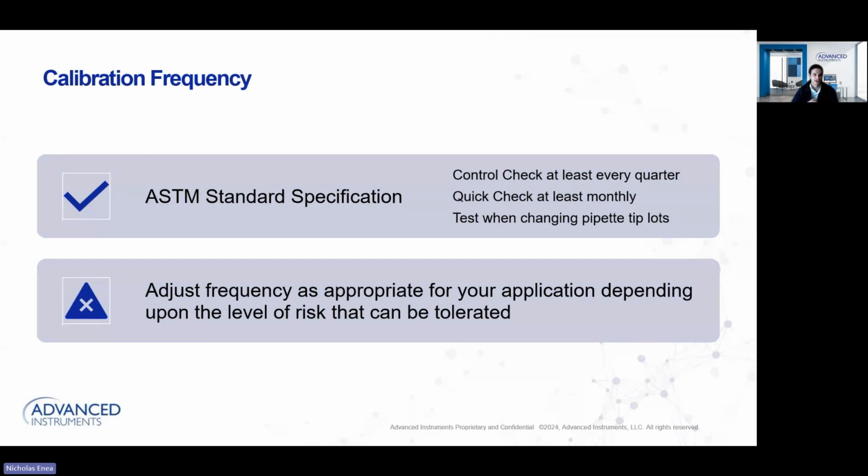For those of you that are working in highly regulated environments or things that involve patient samples, where you can't have rework, or if there is an error, it's a compounding error, then the frequency may be a lot more. Or if you're working in an R&D laboratory, which I like to call the Wild Wild West, where I came from, it's maybe not as often when it comes to some of your application and frequency verification and calibration checks as well. It's really up to you.